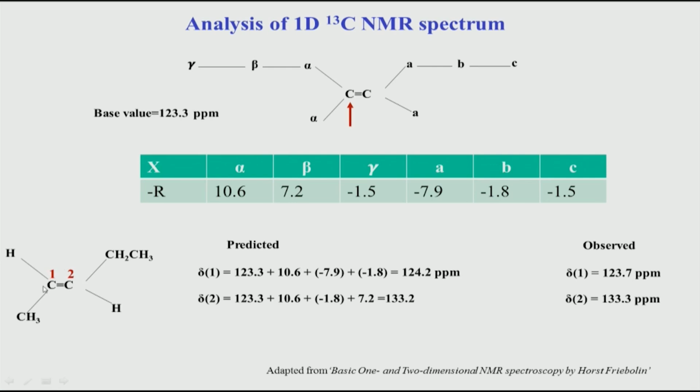If you see 2 peaks in that region corresponding to these 2 positions, and you want to assign which carbon is which, you can easily assign that this peak at this ppm corresponds to C1 in this molecule, and this other peak is C2, based on this prediction.